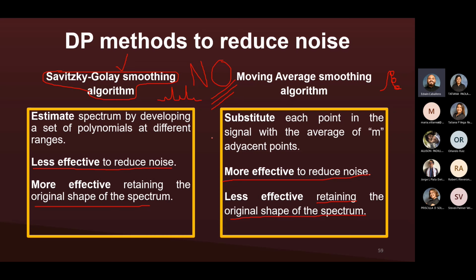Noise reduction methods when I do modeling. Why? Because it's basically too much tampering with your data. It's not reproducible, or it's not even fair, because you're basically cleaning it up for convenience. It's too convenient for what you want to do, and you're going to lose certain information. So I do not recommend using noise reduction methods.